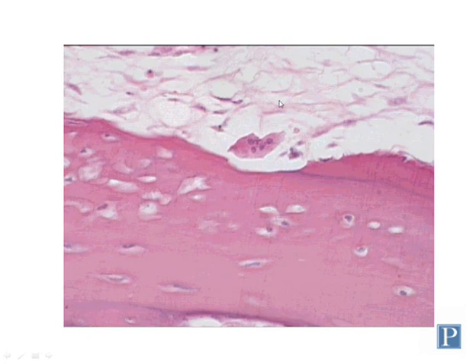Osteoclasts look dramatically different than the other cell types because they come from a different cell line. These particular cells are derived from monocytes, which is a type of blood leukocyte that we're going to look at in a little bit. So these are actually a type of specialized macrophage, and they cause erosions on the surface of the bone, releasing calcium back into the blood, and so they're critically important for calcium homeostasis within the blood.